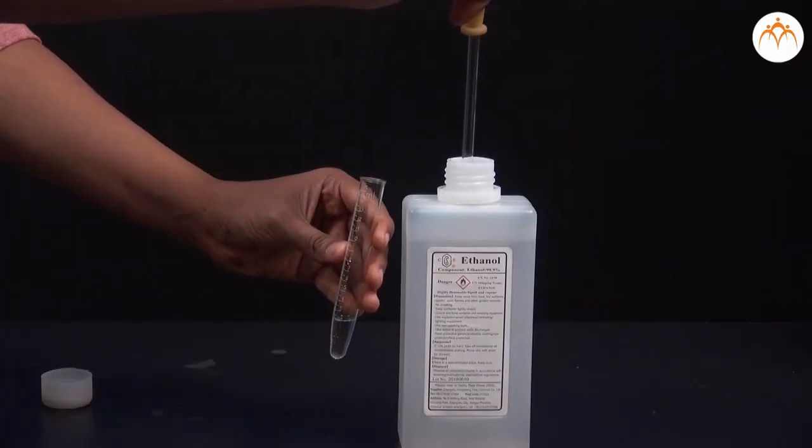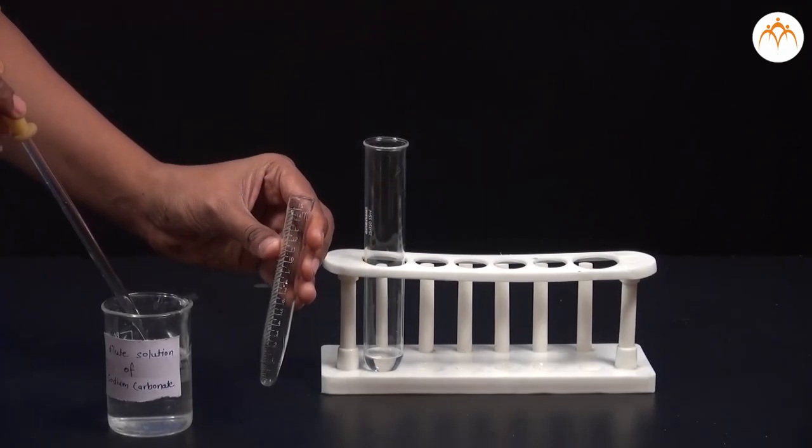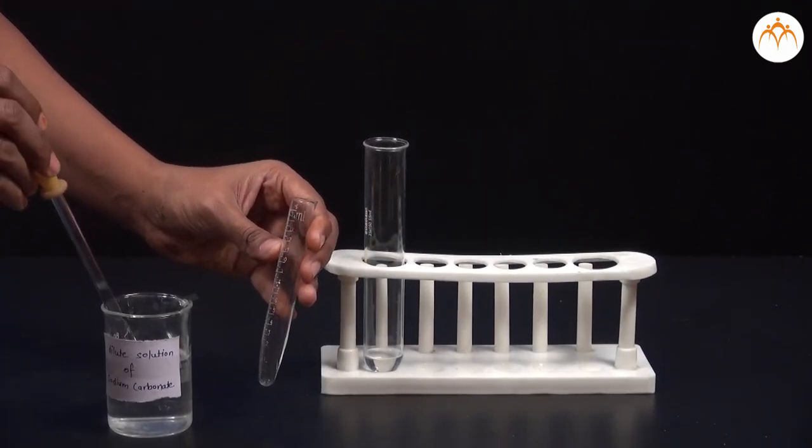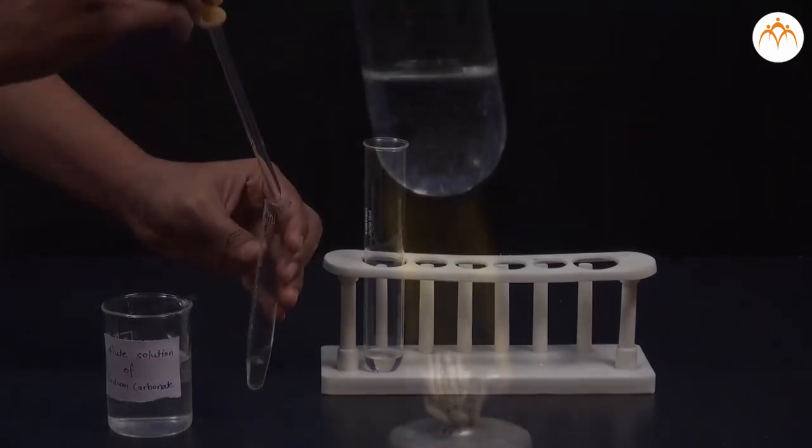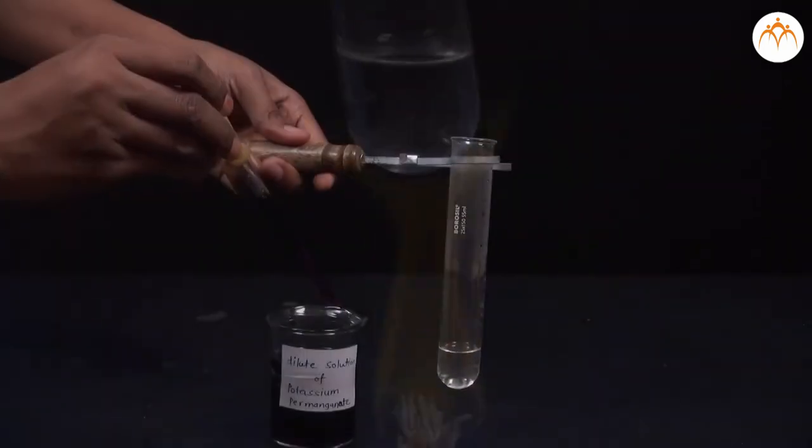Part 1: Oxidation of ethanol. We take 2 to 3 ml of ethanol in a test tube and add 5 ml sodium carbonate solution to it. We warm the mixture on a burner or spirit lamp.